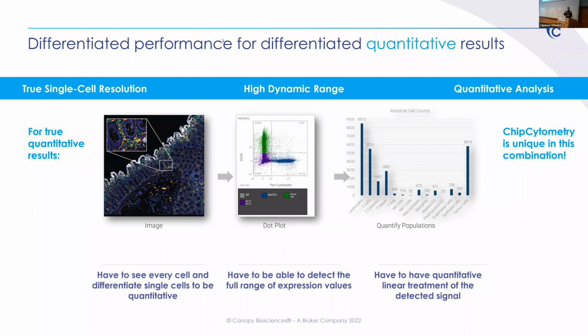Yeah, absolutely. The other thing that builds off that is, with the sample in place like that, that's not a challenge really. Most microscopes can do that. The challenge is if you pull the sample off and put it back on again, which we actually can do with what we call a reinterrogation experiment. When you try to re-register that, it becomes a little bit of a bear, and that's something that we can do too.